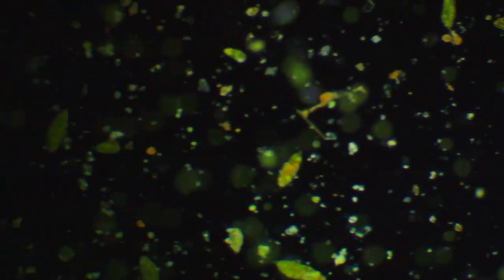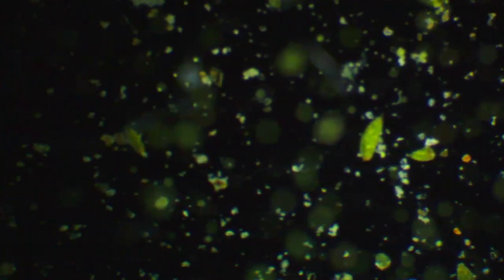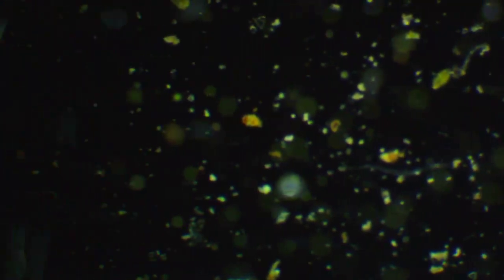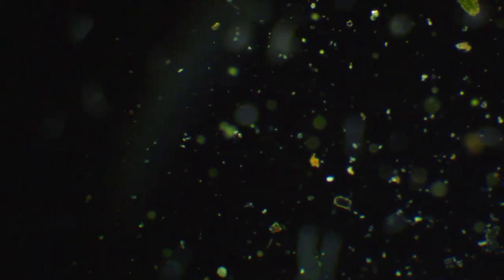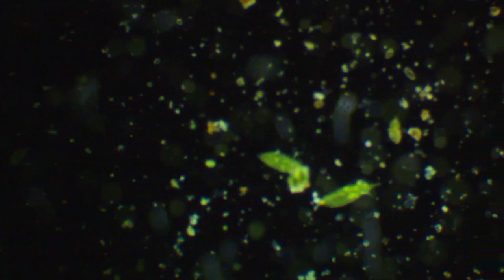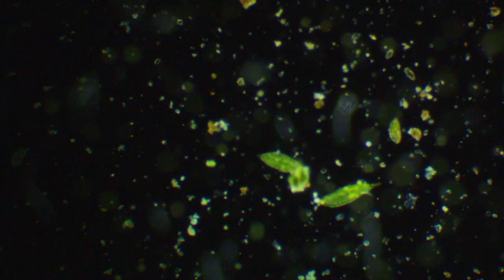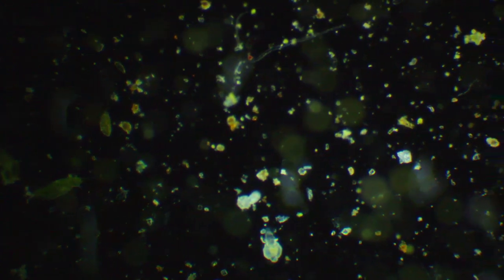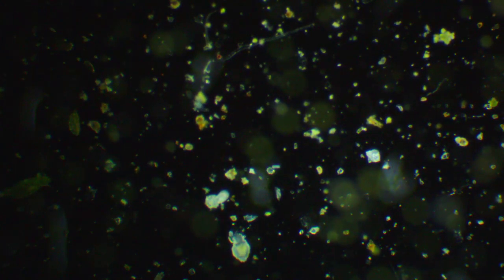So a very oddly shaped drop. It spread out very strangely. I got all the way to the edge on the top and the bottom with only 4 drops. Sometimes I can put a lot more, but it just depends. It kind of depends on the dropper. I had a lot of different sized ones.